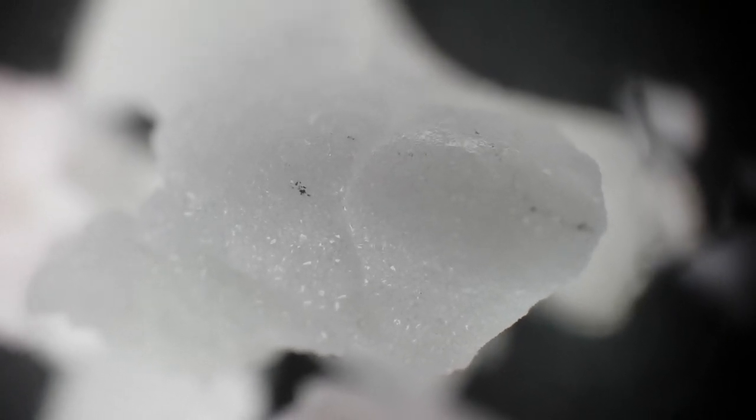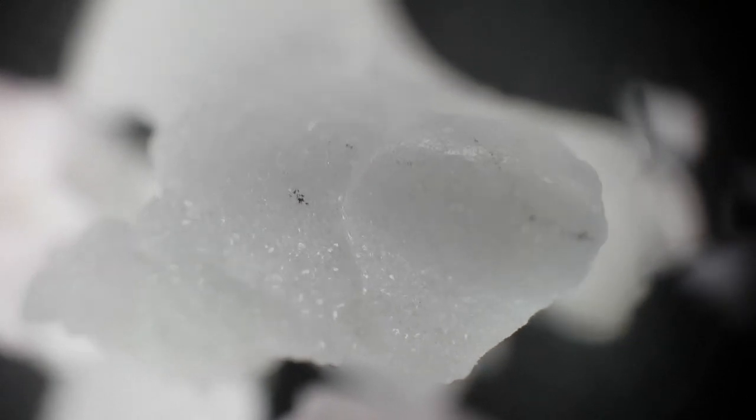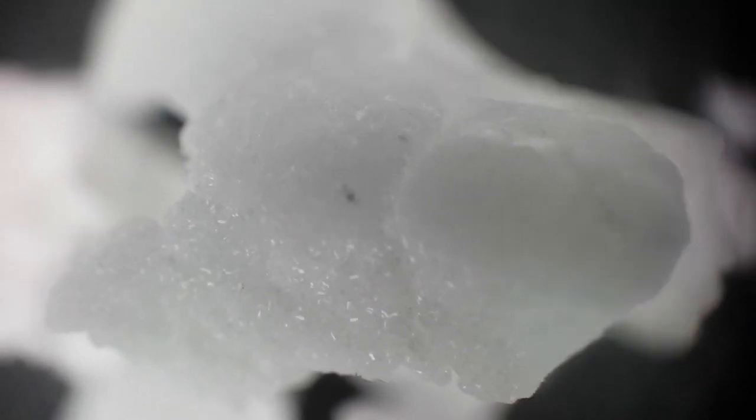So we're having a look at the HHO treated calcium carbonate here and this is I believe some of the hard crust that formed on the surface and you can see it has these kind of little crystallites all over it.